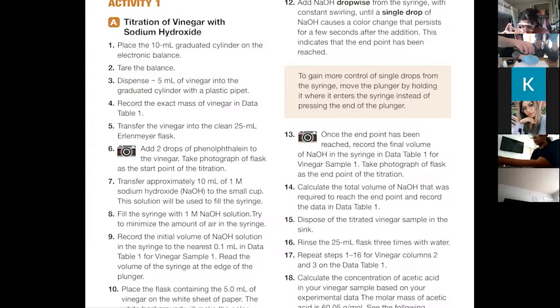So you keep mixing it. See right here, there's a little bit of pink there. Oh, it's gone. But at the titration point, when you mix it up again, if it's still super bright pink, you've gone too far. You want it to be a very pale pink that doesn't change after swirling. That's the perfect titration. So right now you're fine.